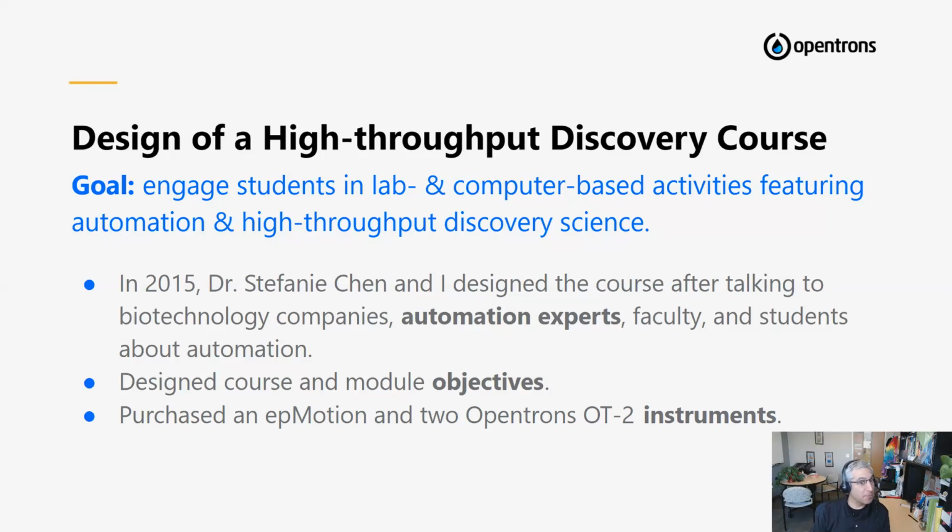We were able to purchase an EPMotion 5075 and 2 Opentrons OT2 instruments thanks to internal grants and funding. And this got us up and running, and we were able to pilot experiments in the lab with students and a fantastic graduate student, Jamie Nosbish.